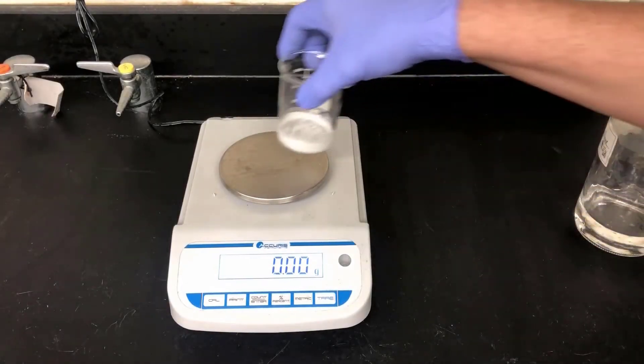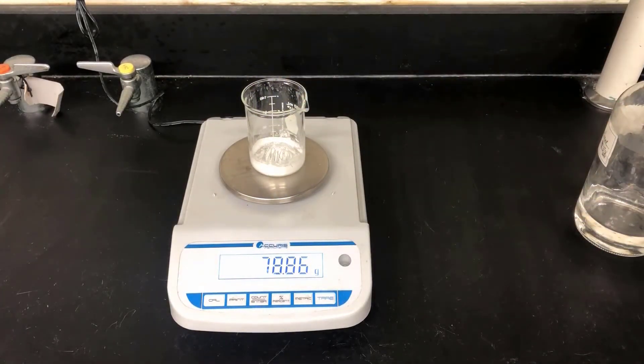Now I'm getting the mass of the beaker with the caffeine in it. I know the mass of this empty beaker from before, so by difference I can get the mass of the caffeine.